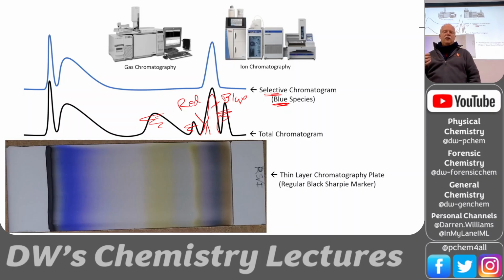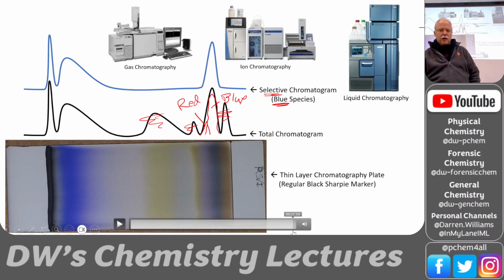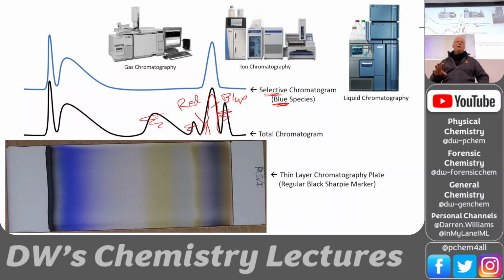We can do the same thing with ion chromatography, and we can do the same thing with liquid chromatography. So these are just different chromatographic techniques. They all have a stationary phase. They all have a mobile phase. We can fine tune the mobile phase, both in ion chromatography and liquid chromatography especially. We have multiple solvents on there and little solenoids that change the nature of the mobile phase. That helps us get those acids off the column.